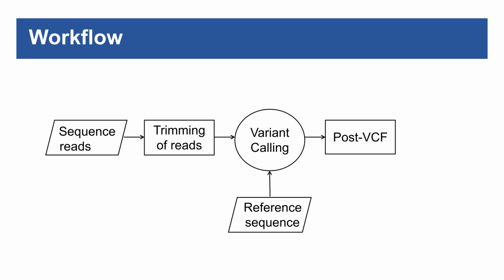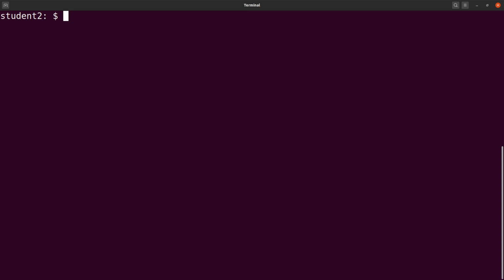We will begin this exercise by first installing SNIPPY and some other tools. And therefore, we have to go to the terminal to do this. I assume that I have installed Anaconda, and so we will first add channels. We will add 2 of them. So we say conda config add channels. Let's add the first one, which is bioconda.